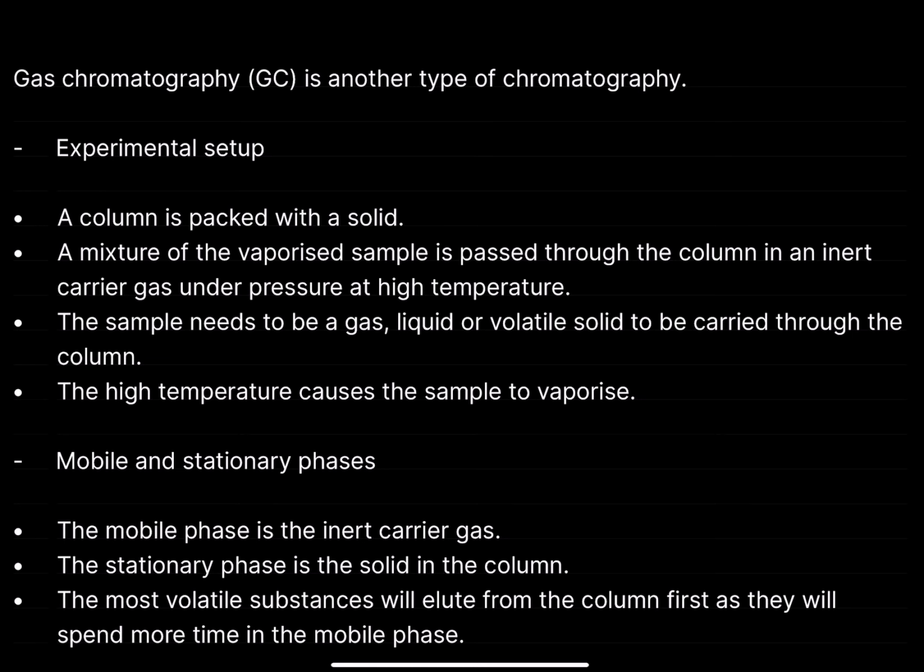One of the better ways of doing it is realizing that gas chromatography is separating out those pure gases. If we're separating out pure gases, then we can just attach a mass spectrometer, which is very bad at separating out, but it's very good at identifying pure gases or pure substances, essentially.